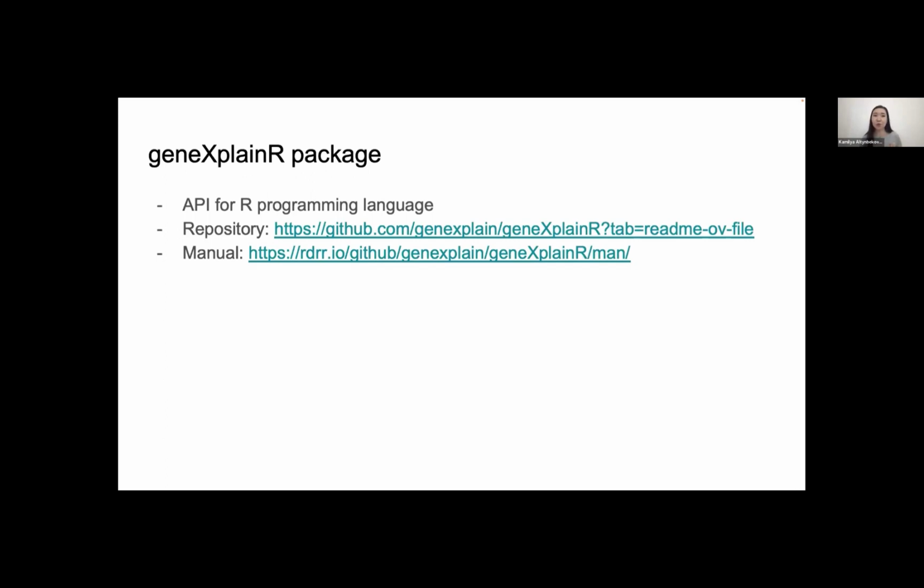I will also show an example, not going into very much detail, but an example of a Python script. And again, as I said, the commands and the way we interact will be very similar to how our R package is done. So it shouldn't be a problem to switch to Python if Python is your main language. But mainly, yes, it's R, Python, Java, and then the JSON interface, which will allow you to access the platform from most environments. We'll also see it a bit later.